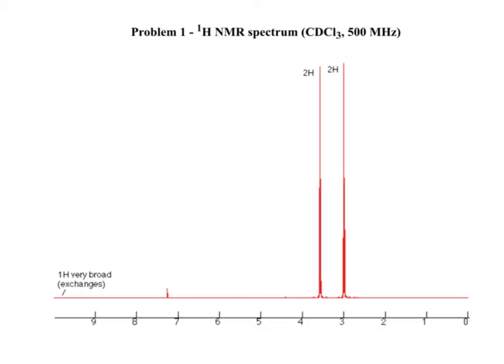So here we'll start with the proton NMR graph. As you can see, there are 3 peaks, with 2 of the peaks being very, very strong. Using calculus and integration, the area under the peaks has been calculated for us. As you can tell based on the integration, there are 2 groups of 2 hydrogens together and then 1 hydrogen standing alone.